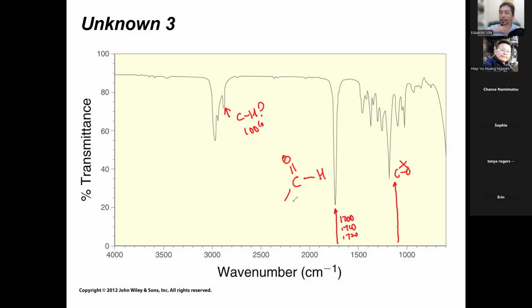If that wasn't there, if that looked like the rest of the stalactites, just otherwise normal, then yeah, you might just assume it's a ketone. But that individual, tiny one tells you that it's an aldehyde. It's just practice, right? It might not be apparent right away because we just learned this like an hour ago. So if you're still like, well, I'm still not sure, that's okay. You got to let it settle in your brain for a few days. That's why you get 2 weeks before the post-lab quiz, and that's why you get 2 weeks to complete your assignment. So, just relax and take it as it comes, right? All righty. Any questions about this one?